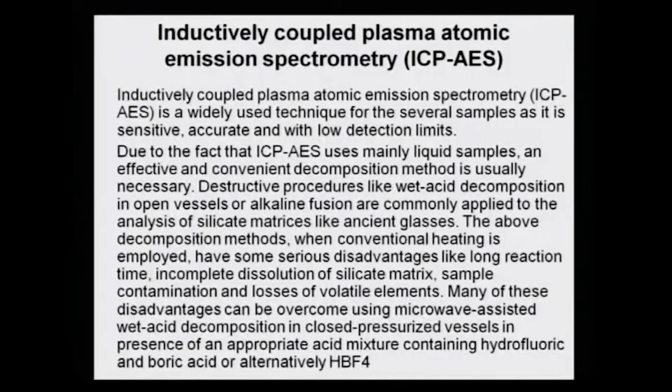Hence, the decomposition method should be very efficient, and that is the most important step, because as I told you, silicate or glass samples are very tough to digest, and unless and until there is a complete wet digestion of these glass silicates, it is not possible to get all the metals extracted into the solution, and unless and until all the metals come into the solution, the analysis can never be exhausted and complete.